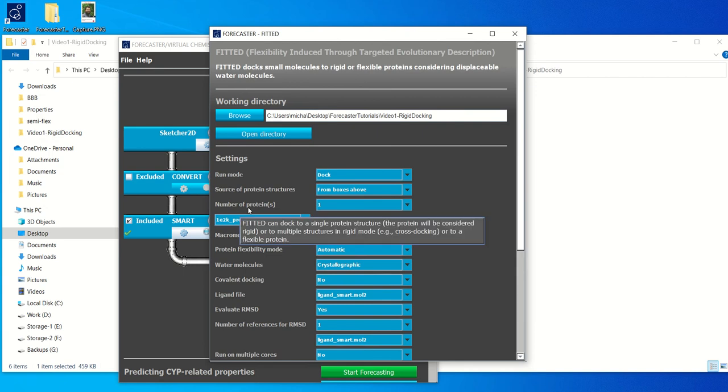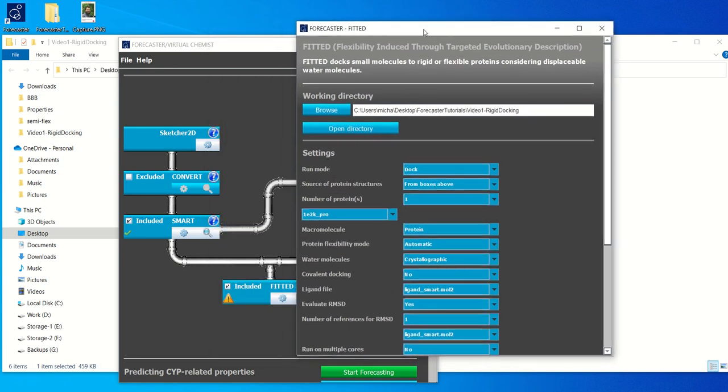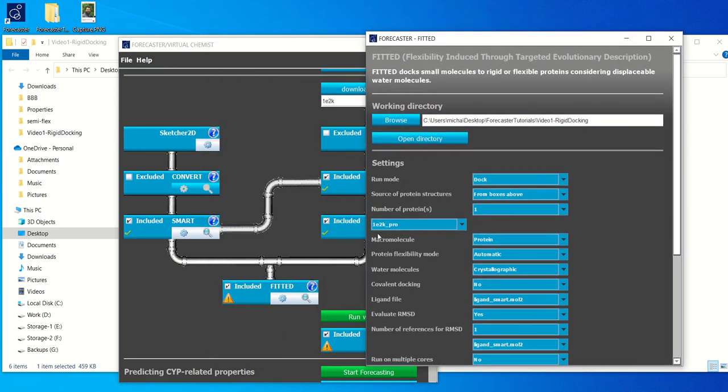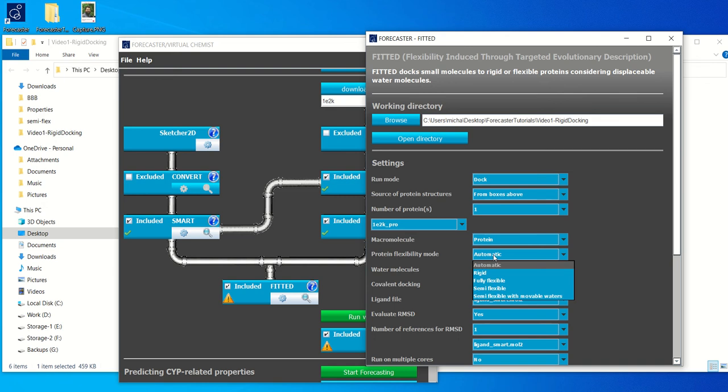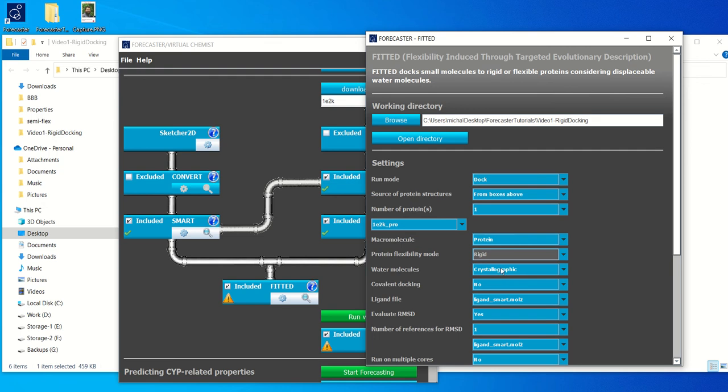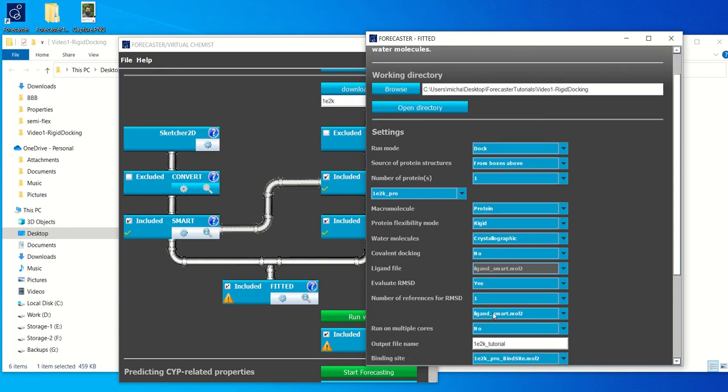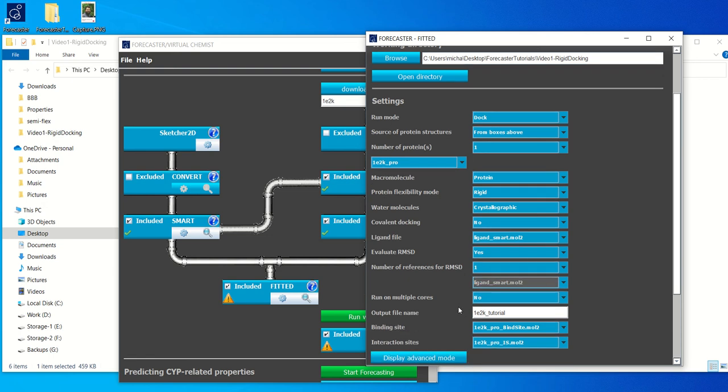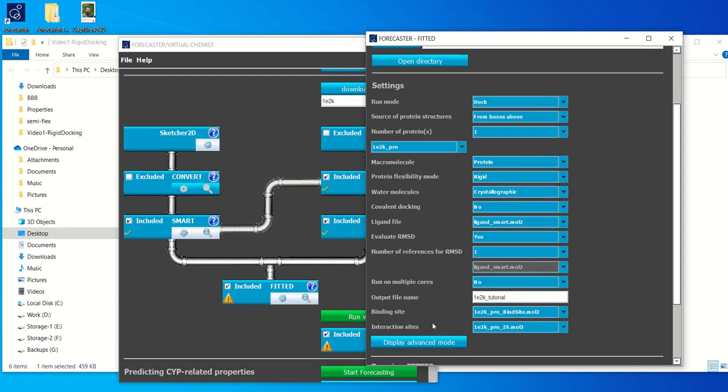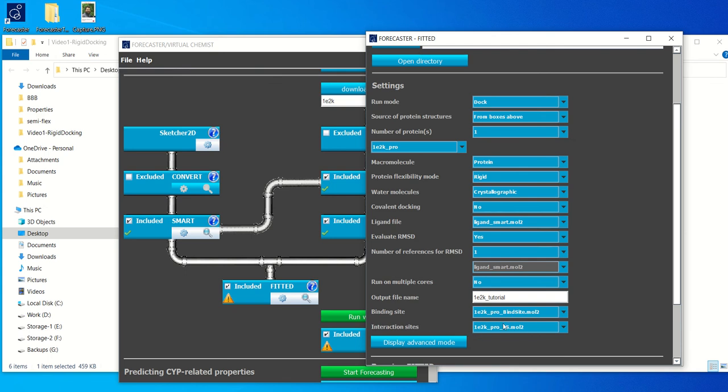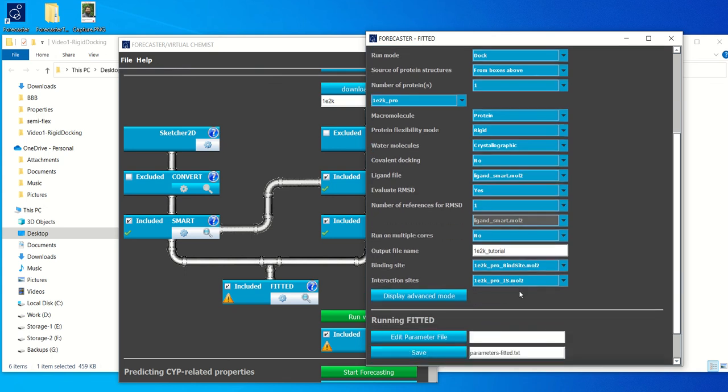So for fitted, we again, just as for process, the boxes have been auto-filled based on the information you've input previously. So we have a protein file. Protein flexibility mode is set to automatic. If you only have one protein, it's automatically set to rigid or you can choose to set it to rigid yourself. Water molecules should be the same type as you've used for prepare. So crystallographic. We're not doing any covalent docking in this tutorial. We have a ligand file, which has to be smarted. Otherwise fitted does not run. And then we want to evaluate the RMSD since we're doing self-docking. And we have one reference for the RMSD, which is the smarted ligand. And we don't want to run it on multiple cores. One core will suffice. And then you can save the output file as you wish. And then the binding site and interaction sites are automatically set up based on the information from process.